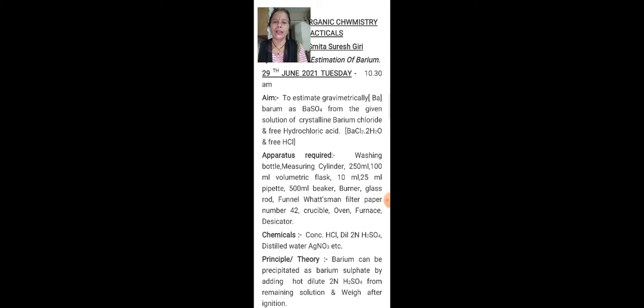I have sent the word file of the gravimetric estimations to you this morning. Do you get it? Yes. Now, for explanation, I made this presentation. Let us see how the gravimetric estimation works with barium. This is the second experiment, which is the estimation of barium gravimetrically.